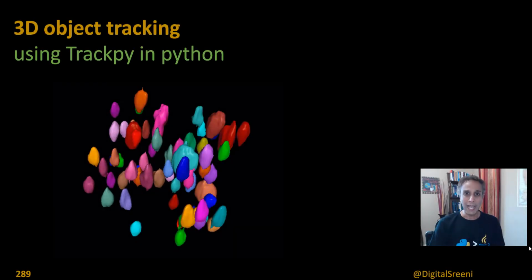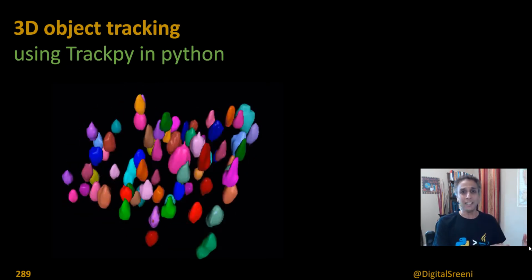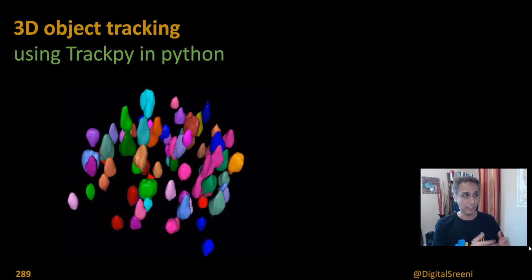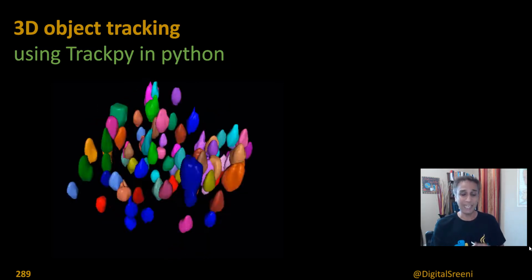Hey everyone, welcome back. In this video, we're going to continue the discussion that we started a couple of videos ago about tracking, especially using a library called Trackpy in Python. And here we are going to focus a bit on 3D dataset or object tracking.